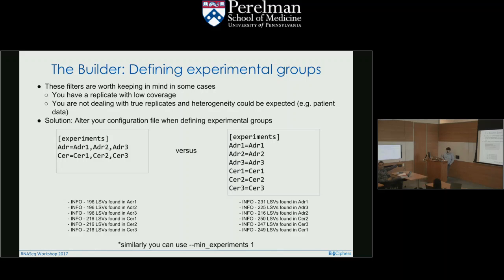But maybe your needs are very different. Maybe your data is more heterogeneous. Maybe you want to be more lenient in your definition. So really keep that in mind: the default thresholds are not magic. They were derived based on what we were trying to achieve, and we were trying to be conservative. So when you do your analysis, figure out what works best for you.